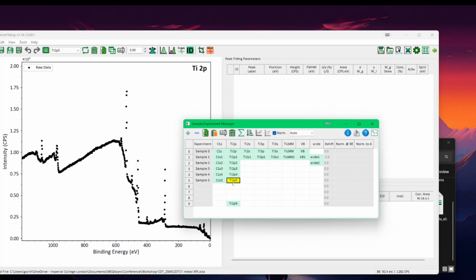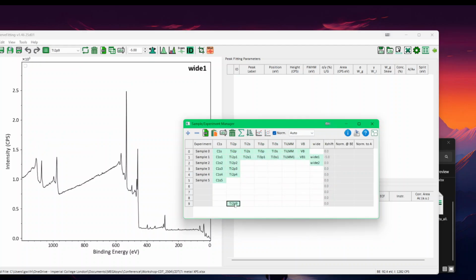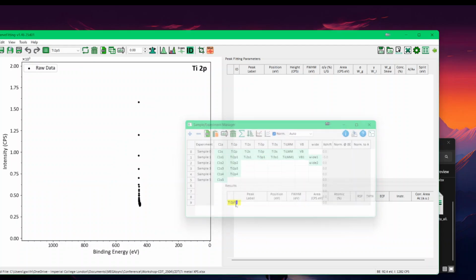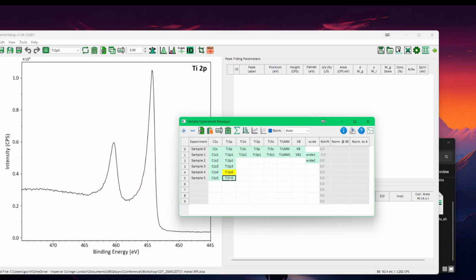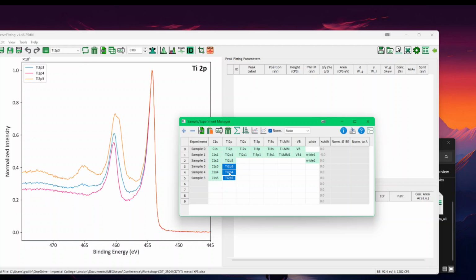There must have been another file on grid 5. That must have been something I had done. So let me just kill that. Let's go to the real 9. So I think there were two of them. So let me just go and call it 5. Let's see if there is another file. As you can see, there isn't. And now we have this file there, and we can just plot them as we like.